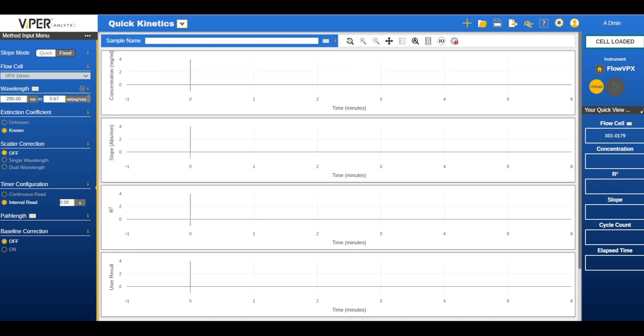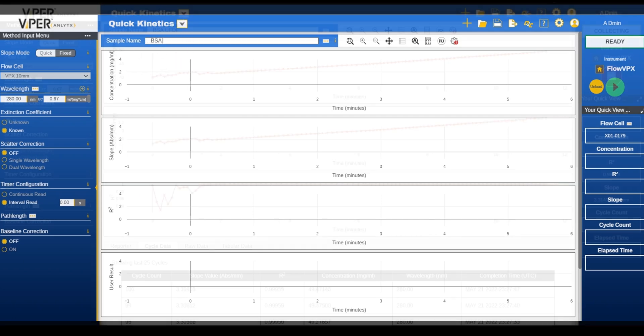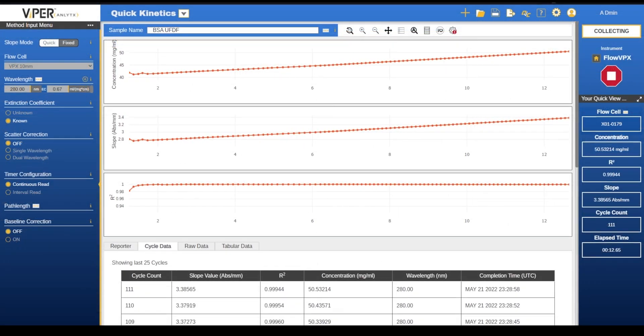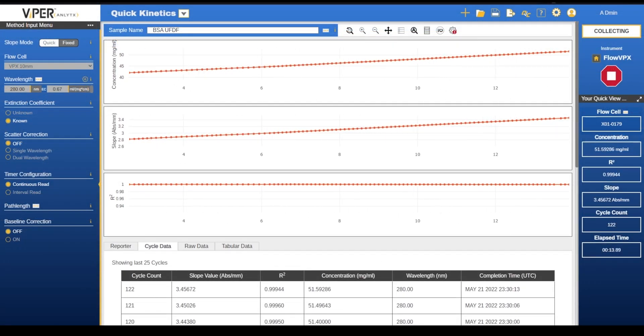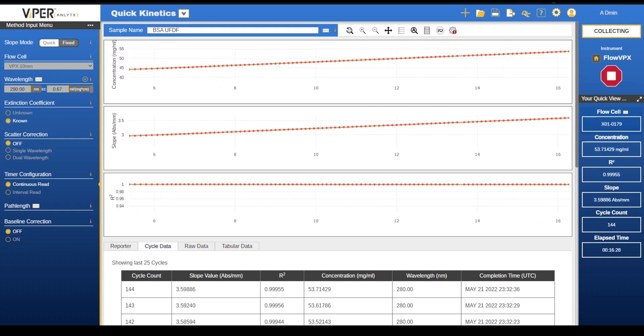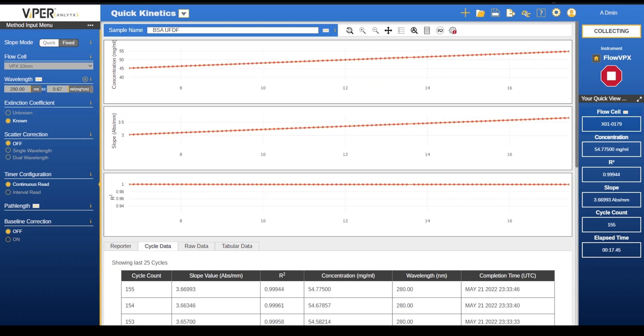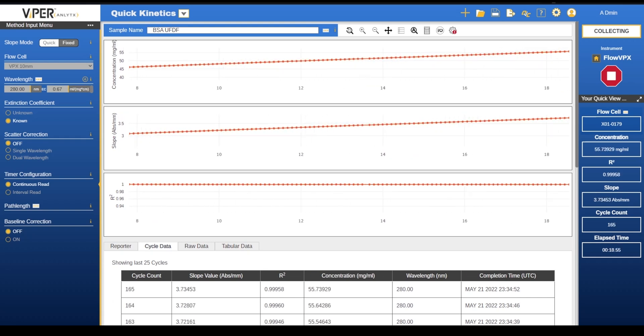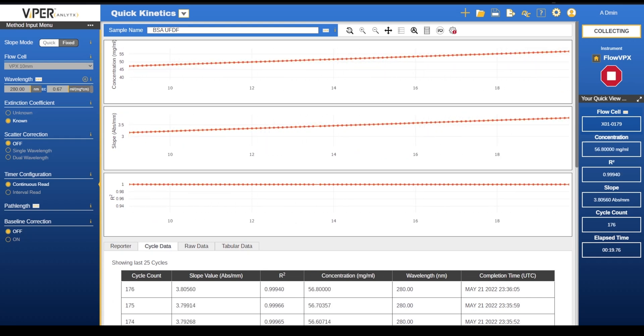A run name will need to be input before being able to press the start icon. For the first ultrafiltration step we will be bringing the solution from 40 mg per ml to 80 mg per ml before moving on to our diafiltration step.